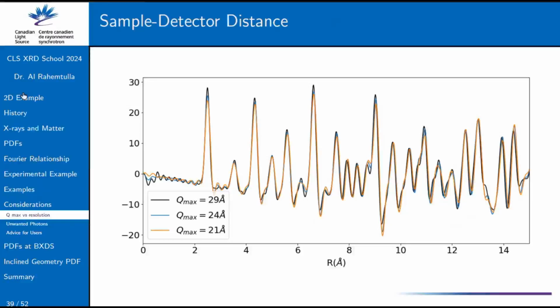And ideally, the best solution would be impossibly tiny pixels going to a very high angle, but then we play out with the trade-off of time measurements, right? We can go back to what we did in the 80s, but I don't know how many people are very keen on spending half a day taking a measurement.